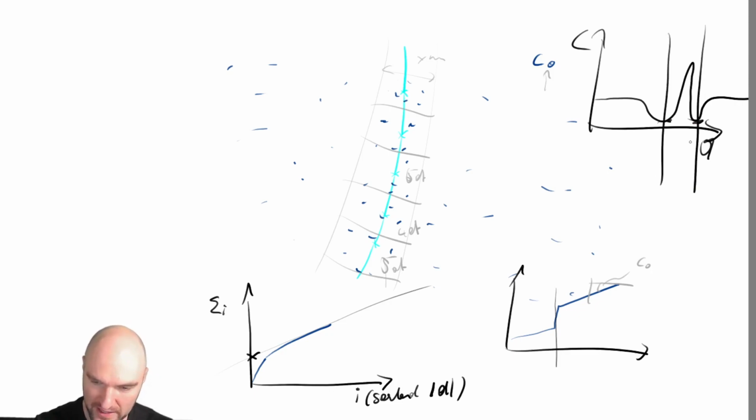You're only looking at the interfacial excess in sort of this area, because the outside is obviously some diffusion still going on. In this case, obviously, the interfacial excess is also not a thermodynamic value. It is a measurement of the segregation at that moment, because there must be some diffusion going on.